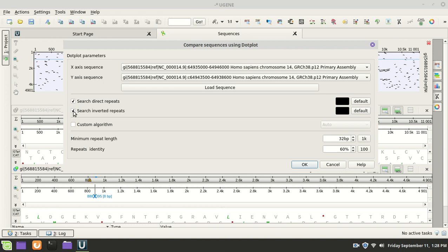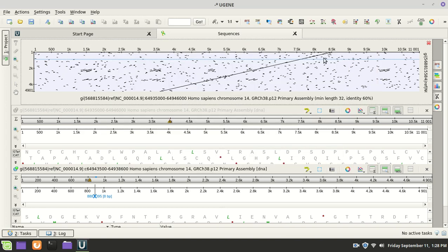Actually, there's a place in Ugene that will just convert it for you and make a new sequence going in the opposite direction on the other. In other words, create the opposite strand of the DNA and let you work with that strand. But be aware of this. This is something that's common. It's easy for students to get it mixed up. And you would imagine that, especially when the databases and the labeling gets mixed up, and it happens way too often. So keep this in mind.